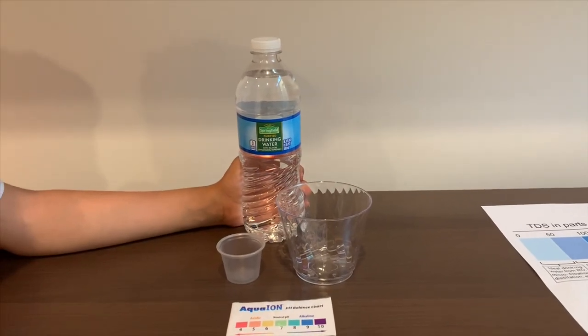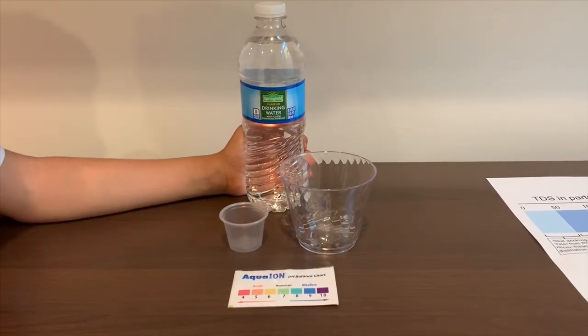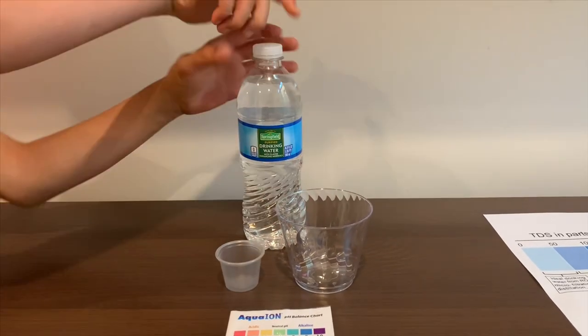This is Springfield purified drinking water. It costs 50 cents. Let's test the pH and TDS levels.